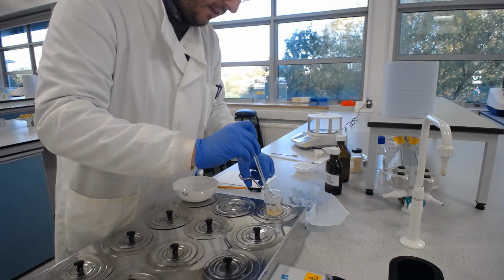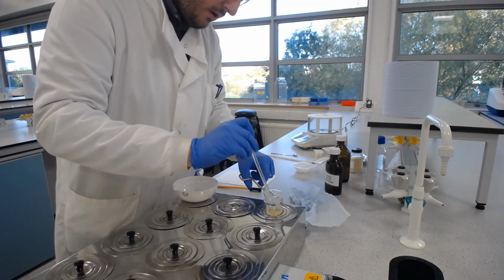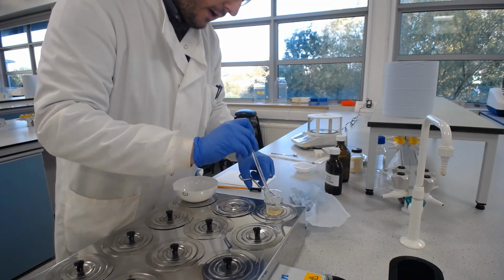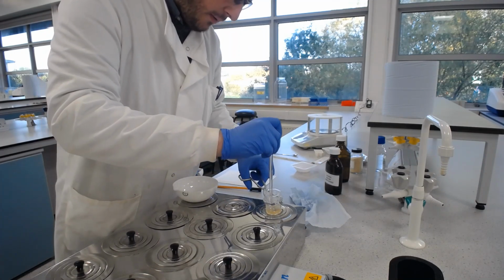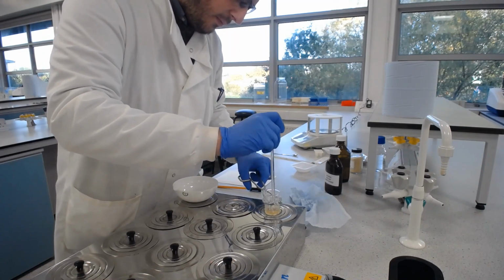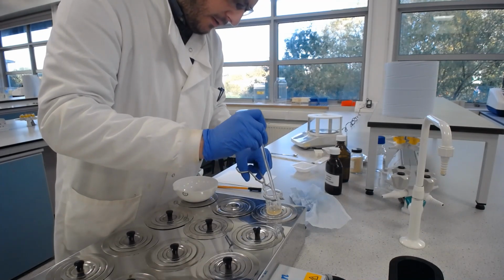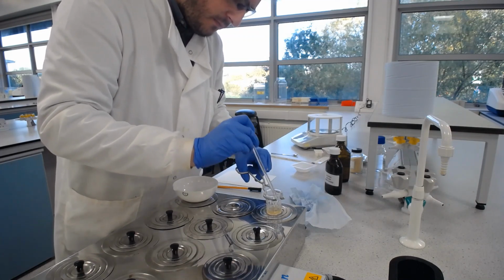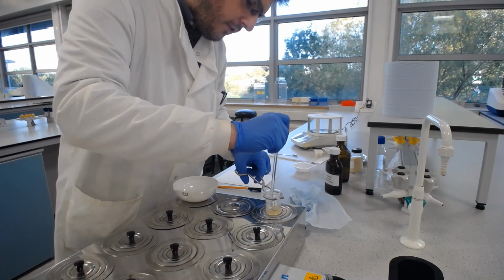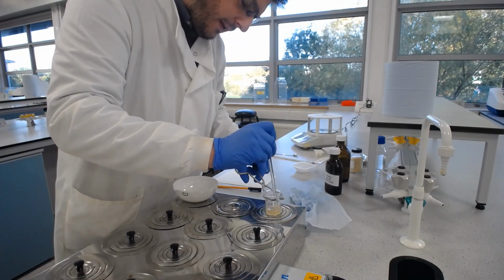You might struggle to get them all in. If it gets to the top and it forms a gel, then you might struggle to get every last little grain in. And don't worry too much about that. Obviously in this setting it's not going out to anyone. We want you to sort of get the process of it and know how it's done. But you can see I'm just pushing down those grains into the warmer bottom so they can be put into the suspension.